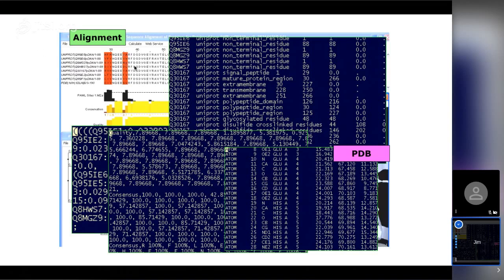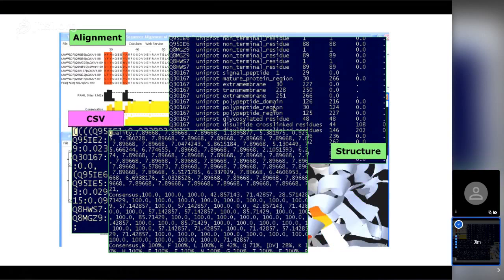This is a reveal of Jalview's user interface. You can see here there are sequences, and there are some red bars which correspond to histograms. PDB stands for Protein Data Bank. This is one of the oldest databases used by both biologists and chemists, used for storing all of the known molecular structures in biology and chemistry. It gives you 3D spatial positions of atoms, and for Jalview, that's a picture of a protein structure or another molecular structure.